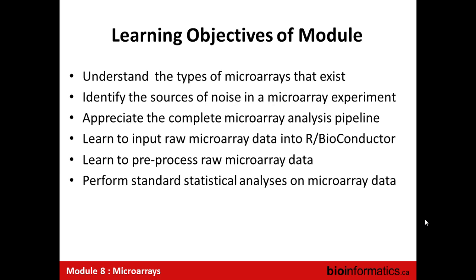What are the steps involved in an analysis? So that when you read a paper, you know, is a key step missing? Have they forgotten something entirely important? Or have they not given us the information I need to interpret what was done?